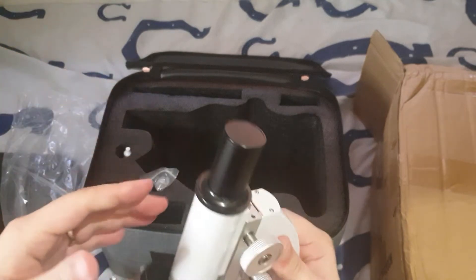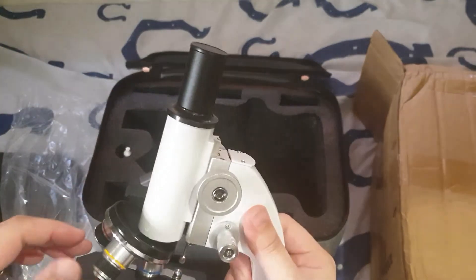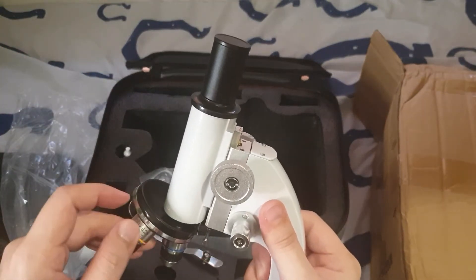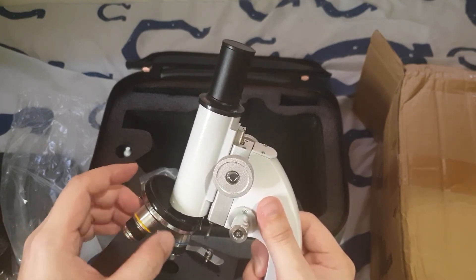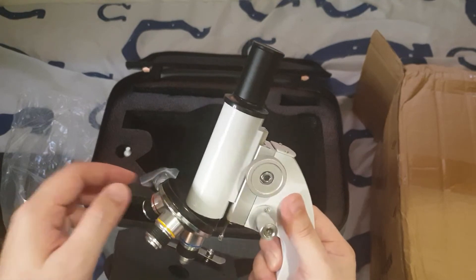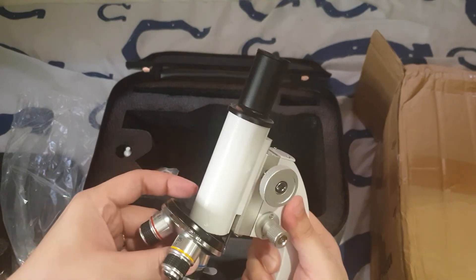How do you replace the eyepieces? I'm not sure. But the objectives are replaceable — yes, the objectives are replaceable.